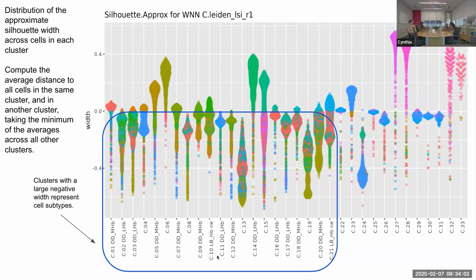But as we have annotated the clusters, we know that most of them correspond to Habenula. That is why we annotate first, in order to see if these could represent communities. And I don't have here a mix of, let's say, glia with another kind of cells, thalamus or vascular vessels or whatever. Most of them, as you can see, represent Habenula clusters. So from my perspective at this point, these could be subdomains. So under this kind of evaluation, the most interesting clusters are those that are below 0.